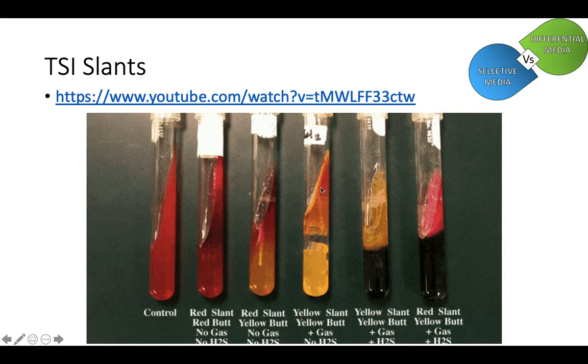Protein hydrolysis takes place in the presence of oxygen. He didn't need to do that. He was able to eat lactose. He was able to eat sucrose. He didn't need to break down the proteins. Given a couple of days or so in here, he might start doing that, but he didn't yet. So he was able to eat the sugars.